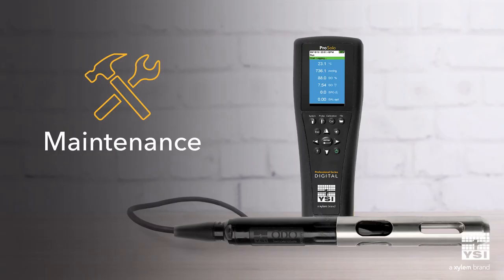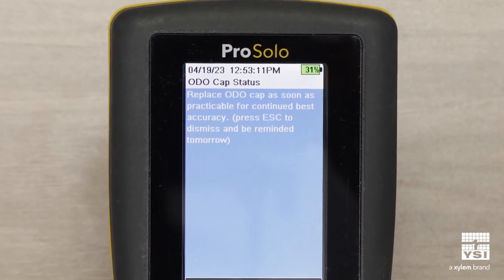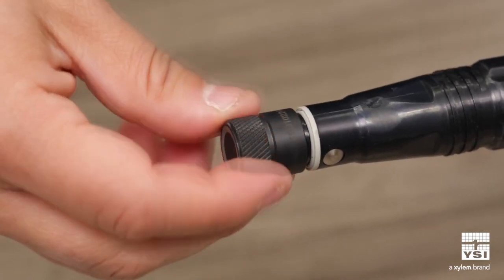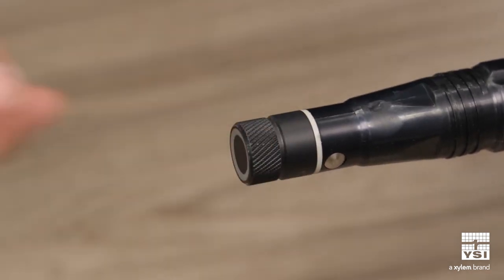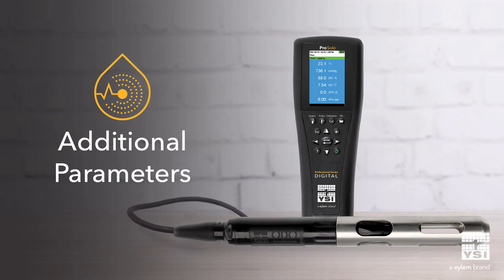The ProSolo helps take the guesswork out of maintenance and planning by giving you the ability to set reminders for calibration and sensor cap replacements. In addition, we've increased the lifespan of the new ODO sensor caps, which allows us to offer a two-year warranty as opposed to the one-year warranty of the ProOdio caps.